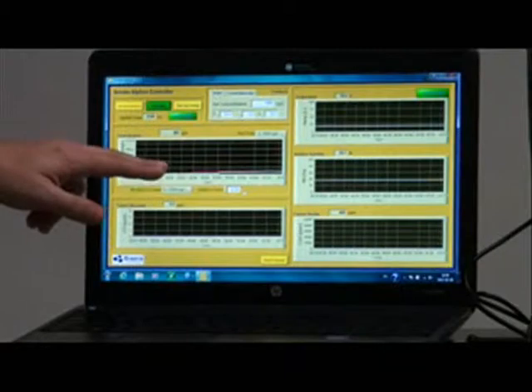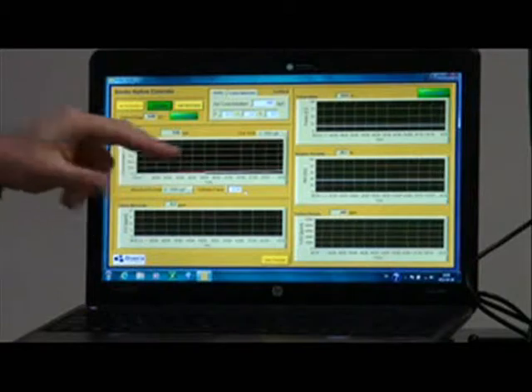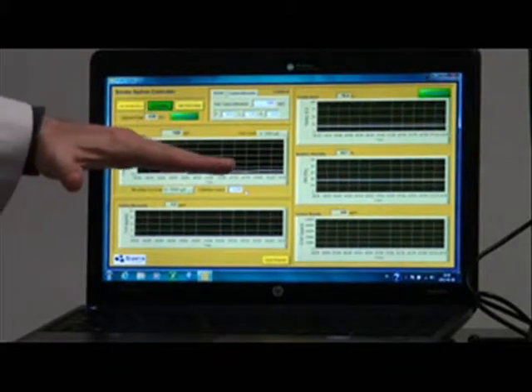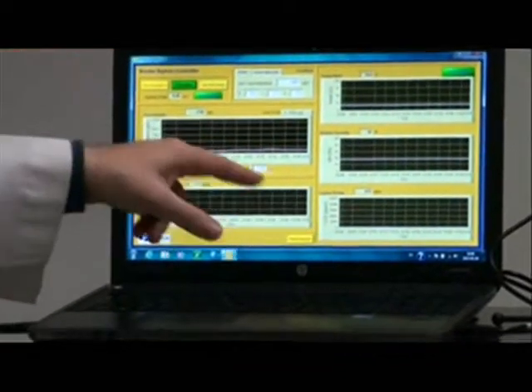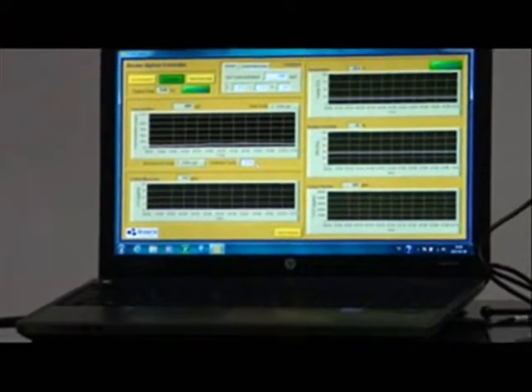And as you can see, the red line that represents the set concentration and the white line, which represents the actual concentration of the cigarette smoke or the e-cigarettes, are almost overlapping each other with very, very small fluctuations. That is an indicator that we have the right combination of pre-dilution amount, dilution amount, as well as the speed of response of the mass flow controller set through the PID values of the control loop.